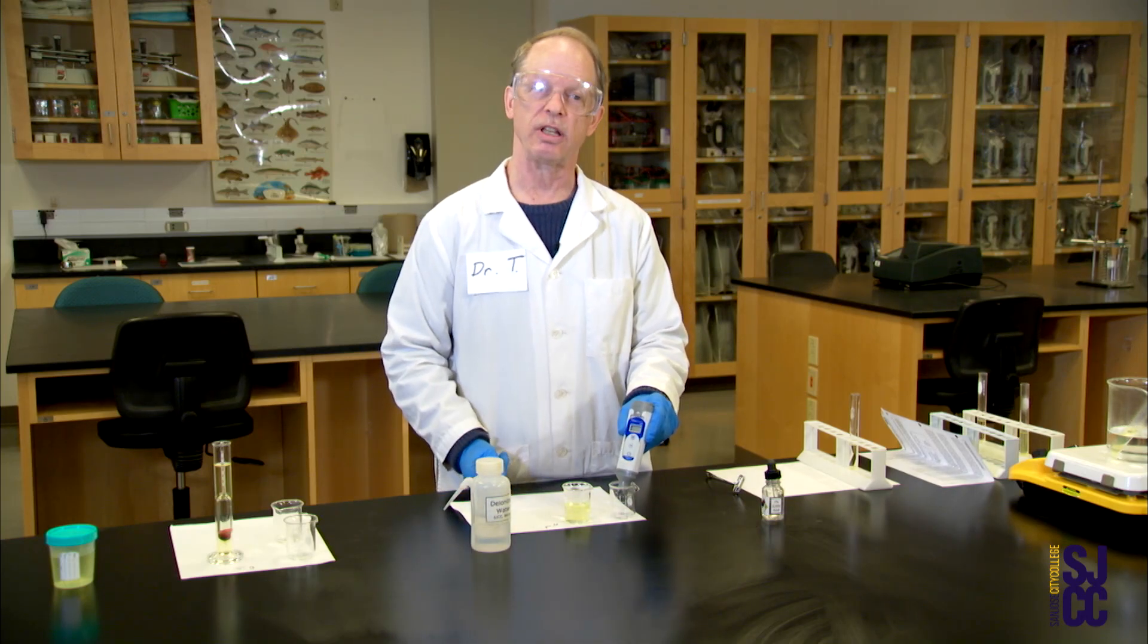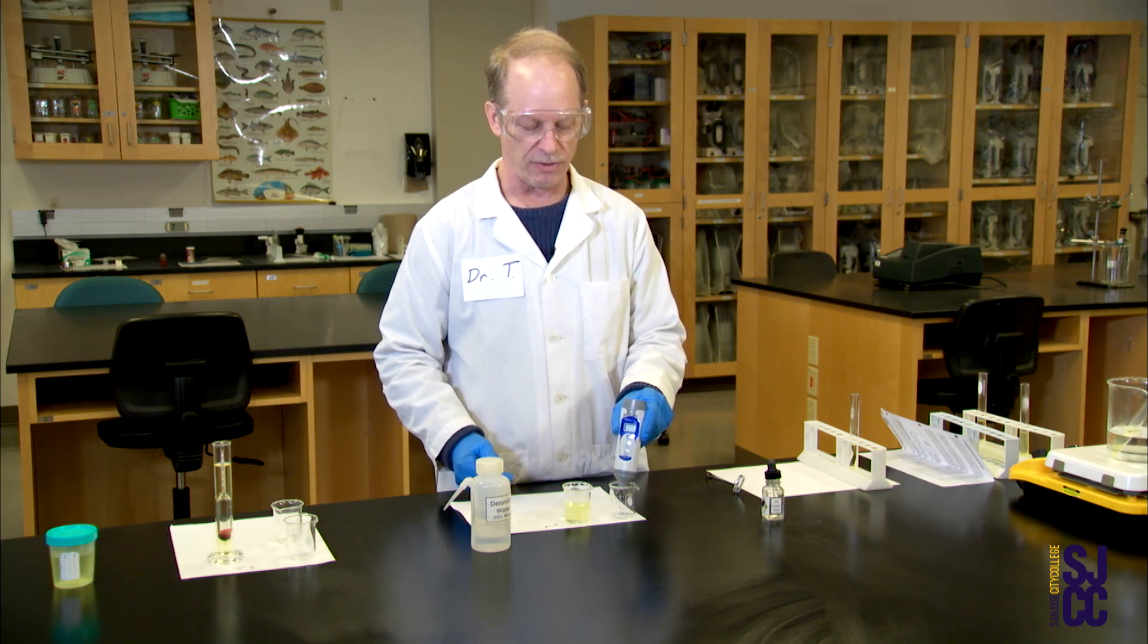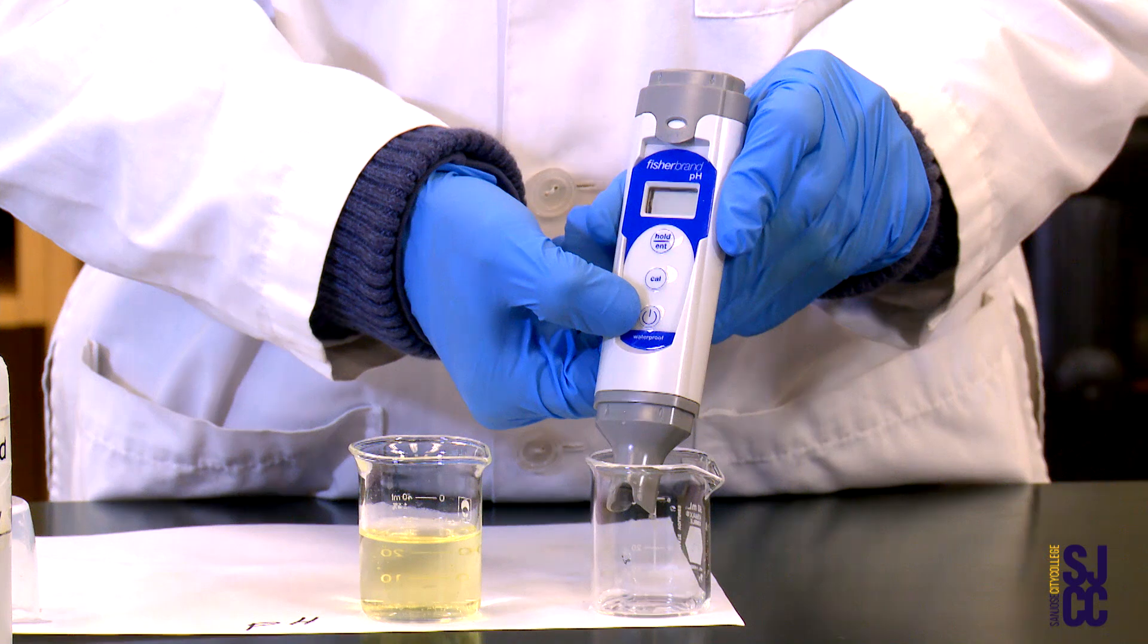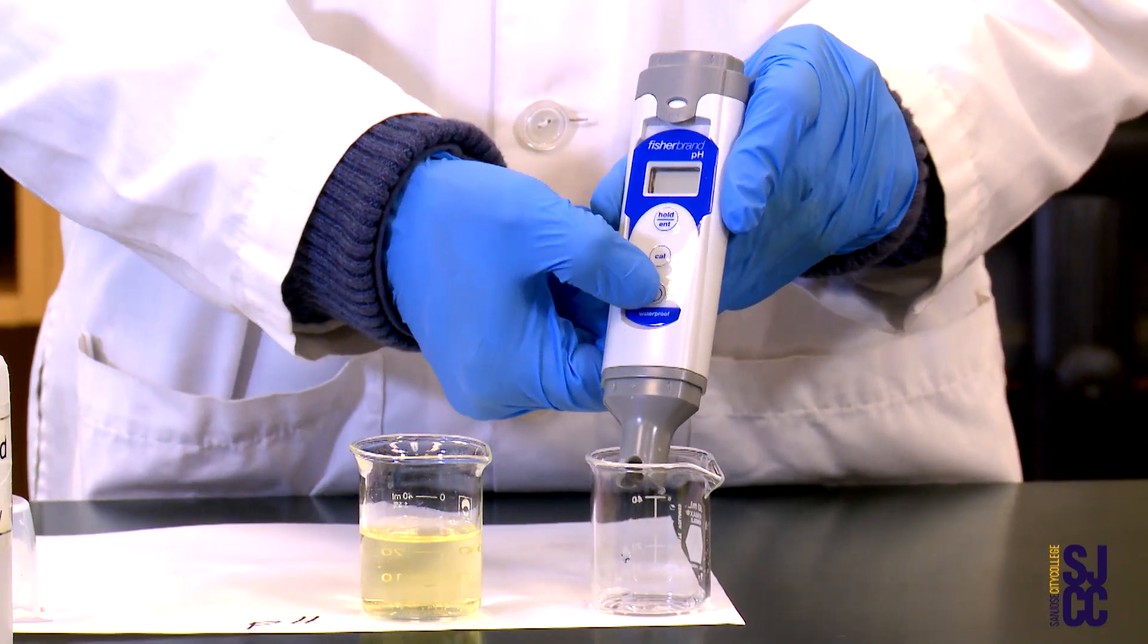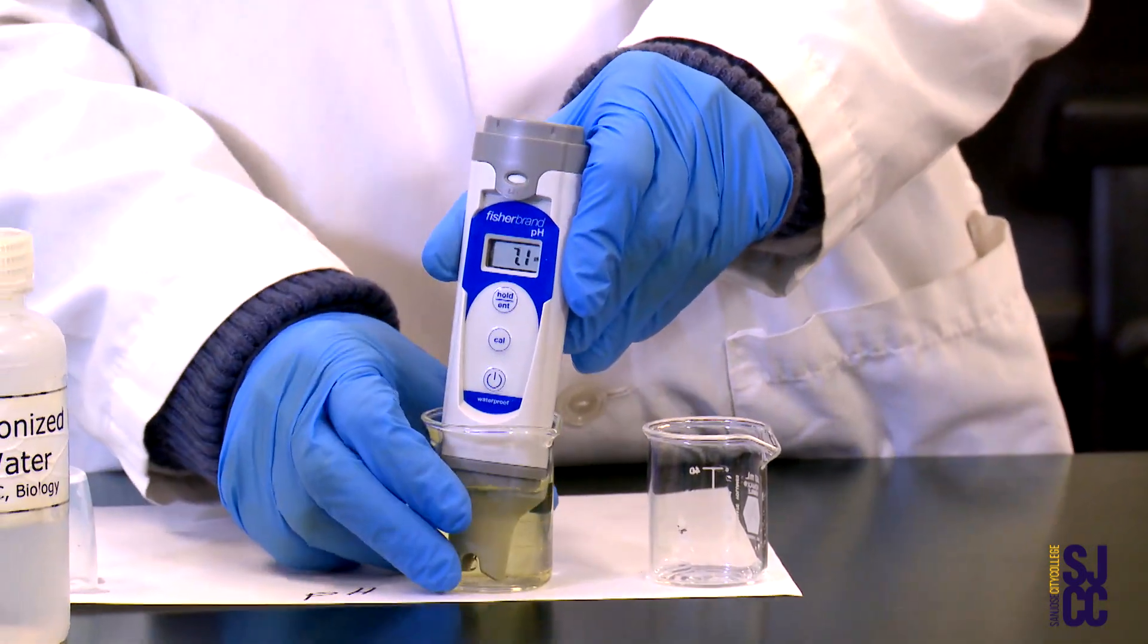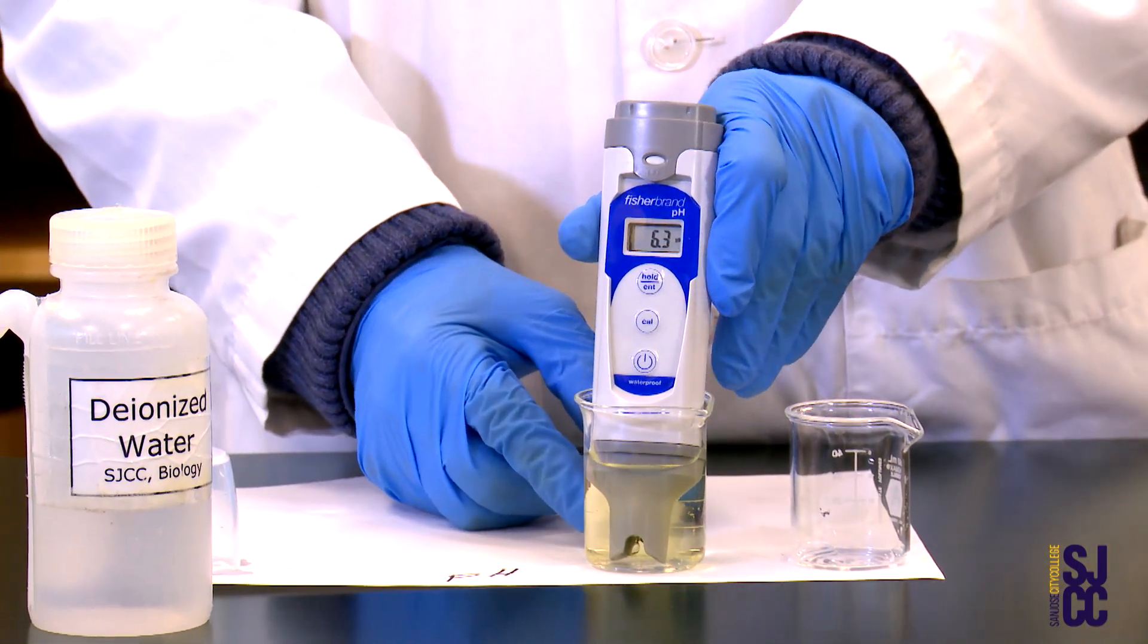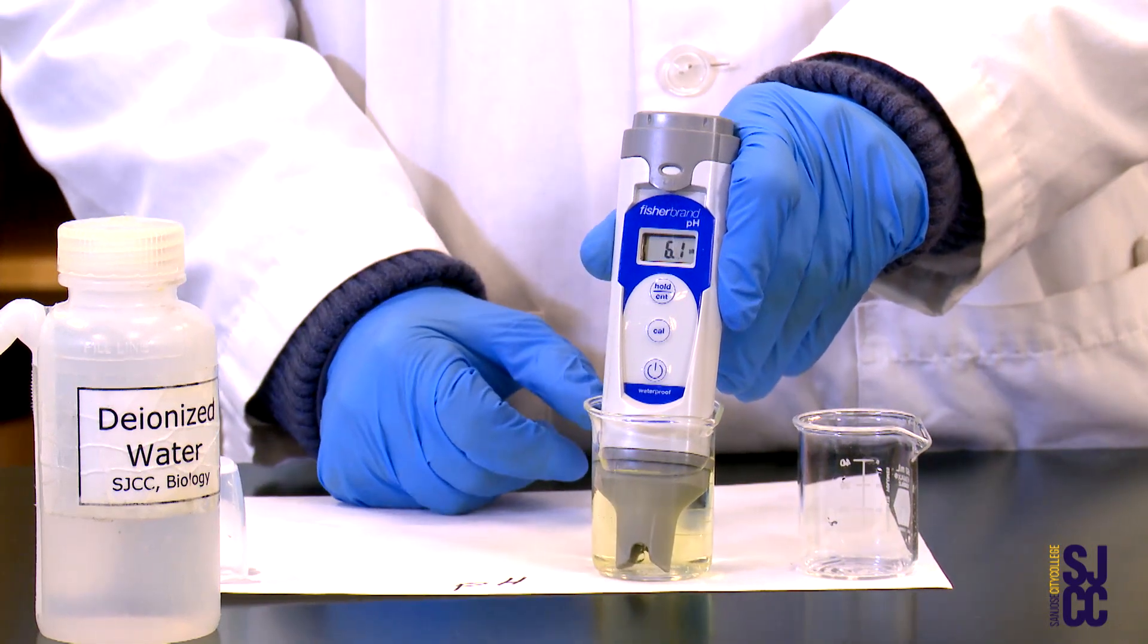I clean it when we start and then clean it again when we finish. Operation is very simple because it's got this button down here that implies power. I just turn the power on like so. I dip it into the urine solution like so - it just happens to fit in a 50 ml beaker like this.